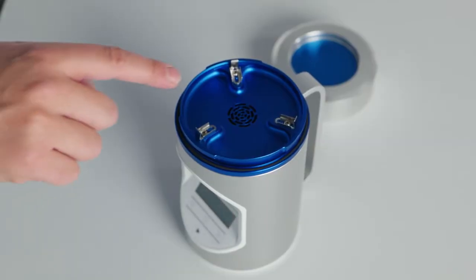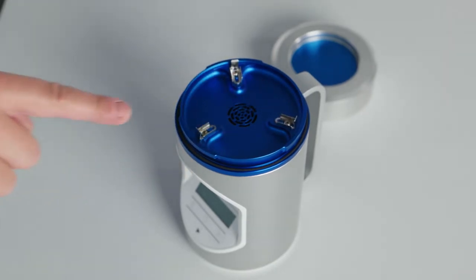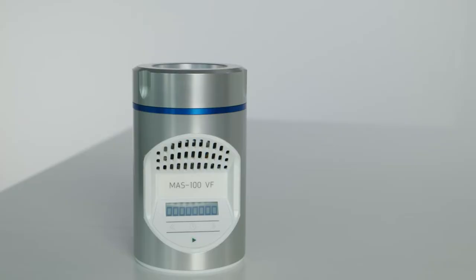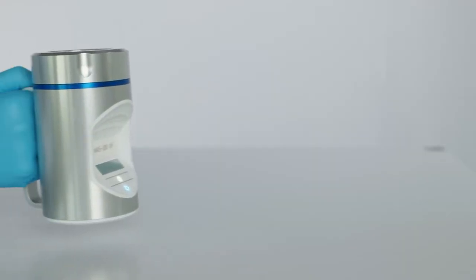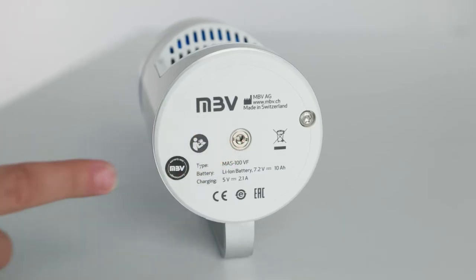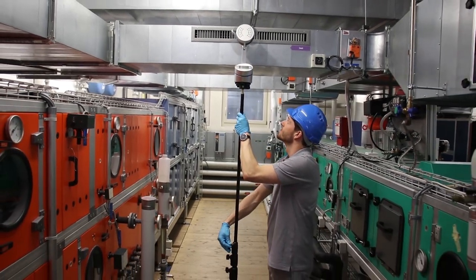Under the lid is the EasyClean plate holder, where the agar plate is held in place with three clamps. The air that is aspirated through the perforated lid is exhausted through this grid. The flow direction of the air inlet and outlet is the same — this prevents disturbing the unidirectional airflow in a clean room. Ergonomic handling of an air sampler is critical, especially when gowned up with multiple gloves fitted. Even with small and large gloved hands, the handle on the back is easy to use. On the bottom of the instrument, we have fitted a tripod adapter. Together with an optional tripod, samples can be taken at every required location.